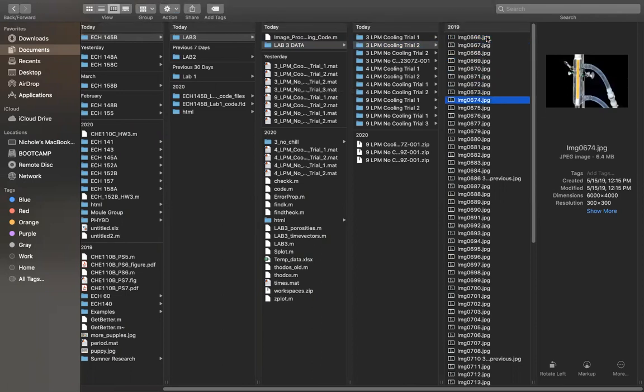Make sure that there's no severe blurry images or changes in column position. There are some light intensity changes, but there's not much you can do to avoid that. Just make sure there's nothing super severe, like a complete whiteout. I already walked through all of these images, so just do that as well before you run this code. Make sure that you're being consistent.